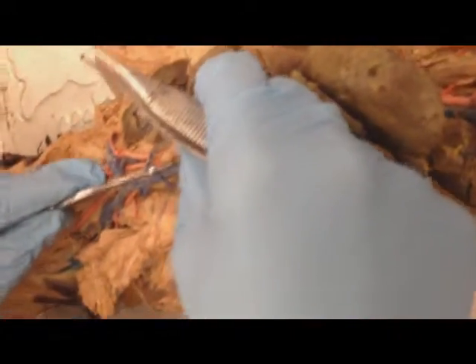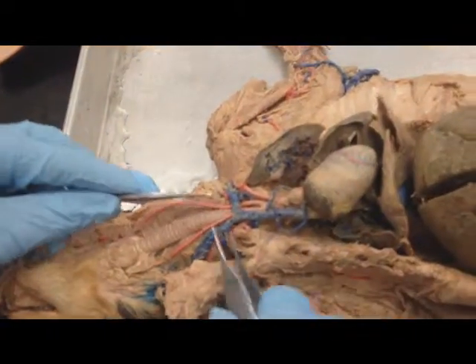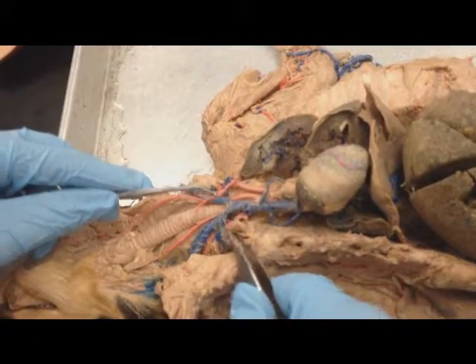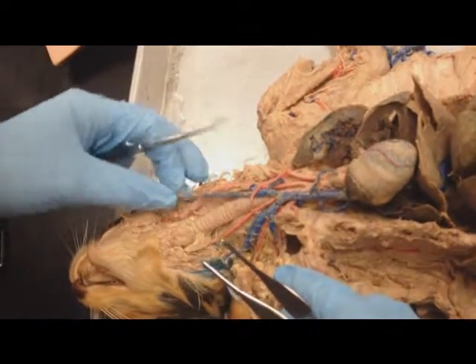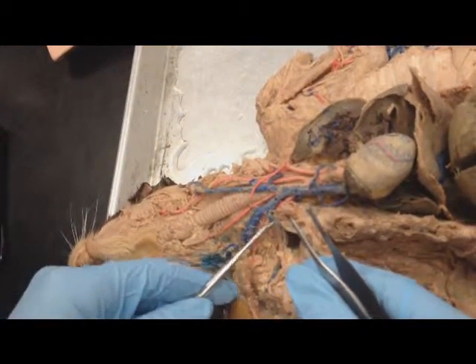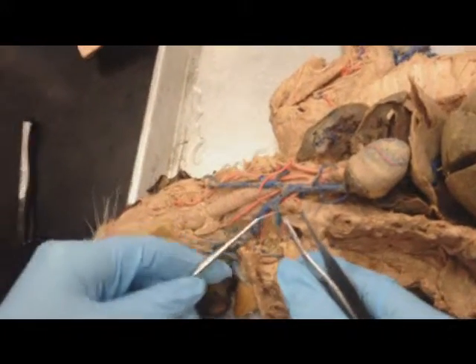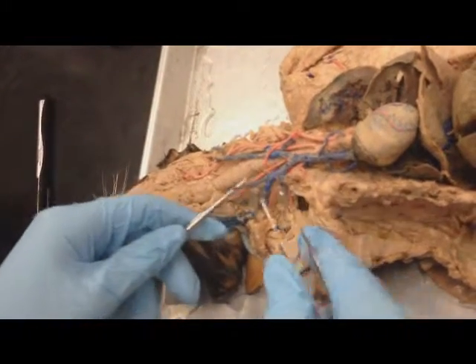So we have superior vena cava, and it branches off into its own left and right brachiocephalics. This brachiocephalic, you can see pretty well that it's going to break off into a subclavian. Just like there are subclavians for arteries, there's one for veins, and jugulars.